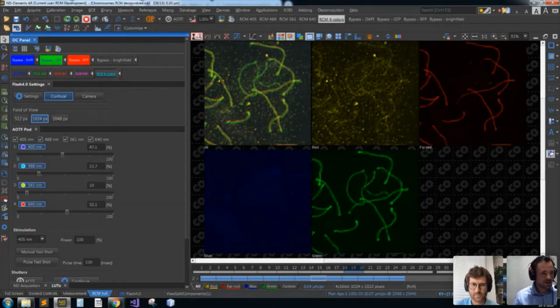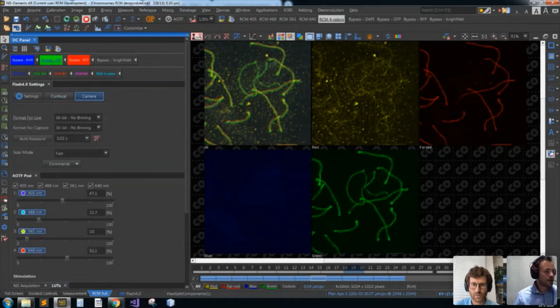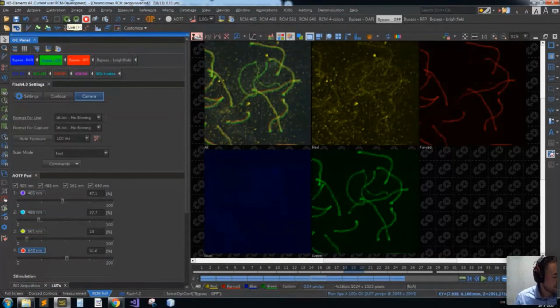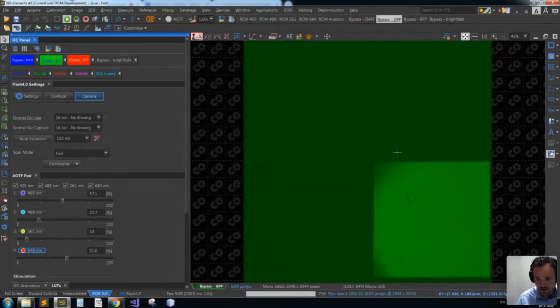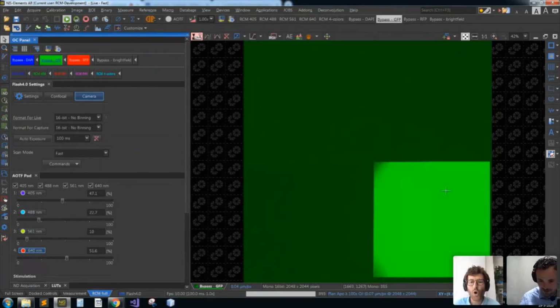image this last sample. So these are BPAE cells. They're stained with DAPI, so nuclei. You will find phalloidin. There is some mitochondria in red. So I'm going to focus on the sample now. Might take a bit of time because there we are.